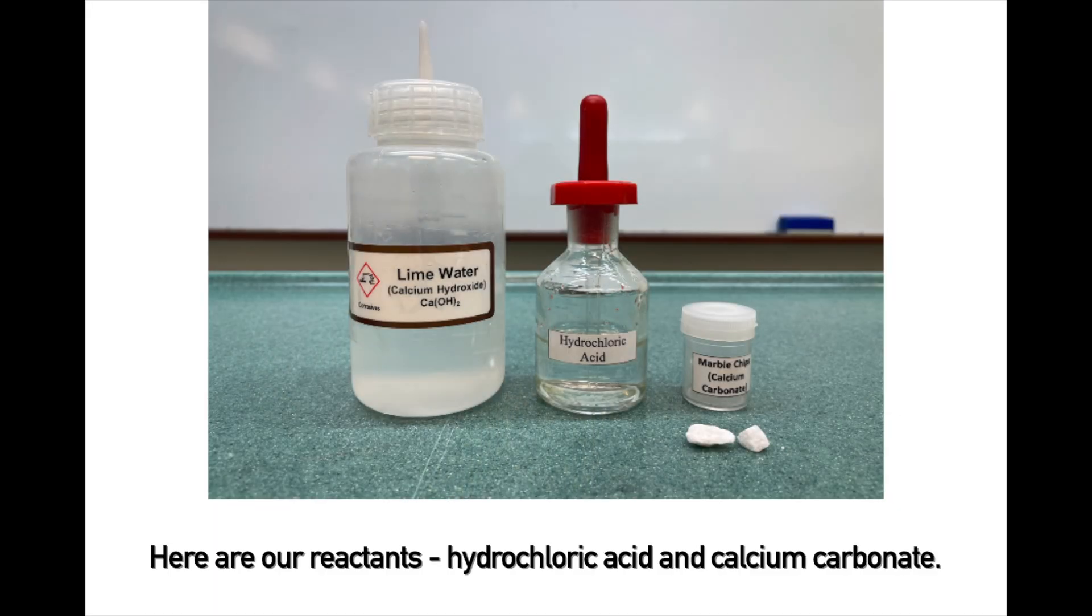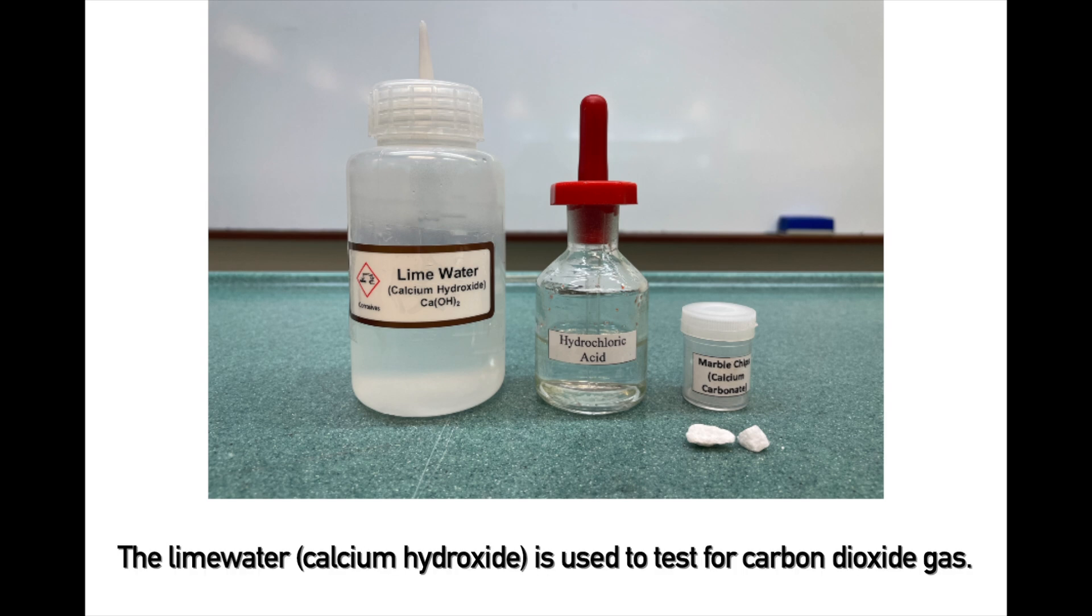Here are our reactants, hydrochloric acid and calcium carbonate. The lime water or calcium hydroxide is used to test for carbon dioxide gas.